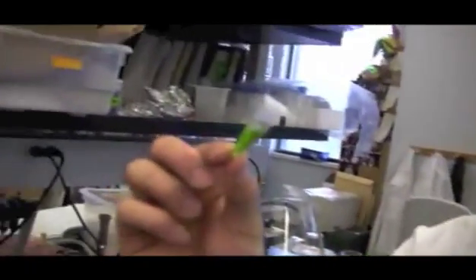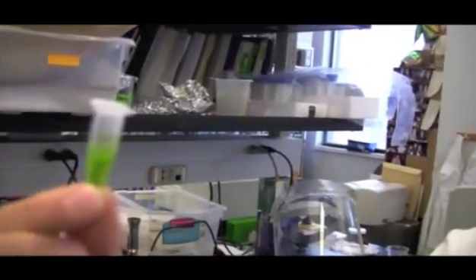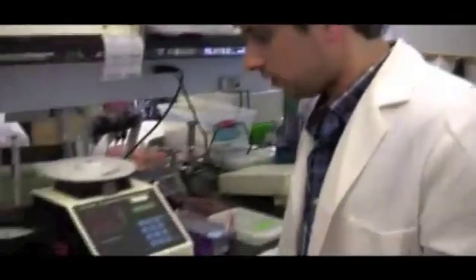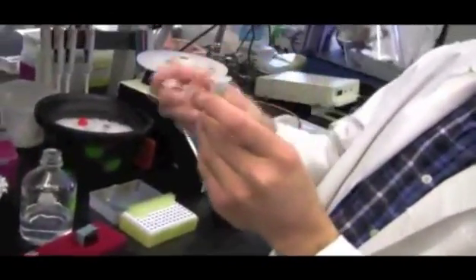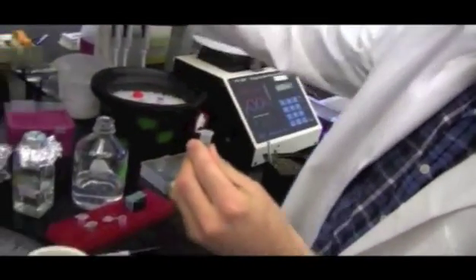So, like I said, all the heavier stuff falls to the bottom, so all the green stuff is a lot heavier, and then the clear stuff at the top is where the DNA is. Okay. So I'm not interested in all the stuff that's down here. I'm only interested in the stuff on top, so I need to extract that somehow. And again, I'm going to use one of my handy dandy pipettes.